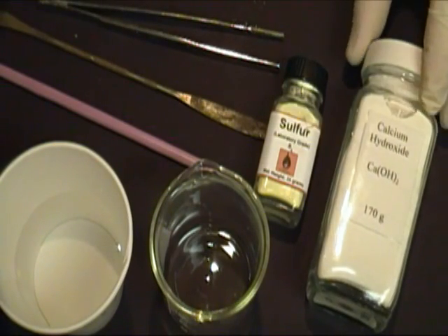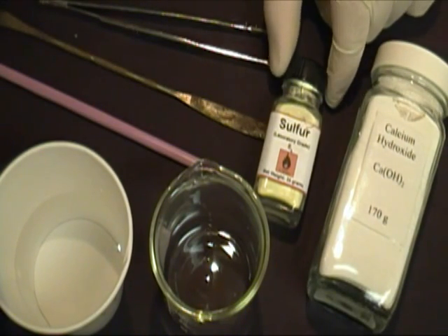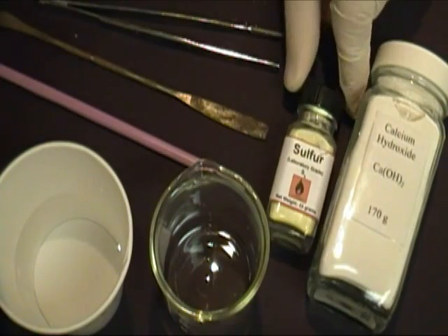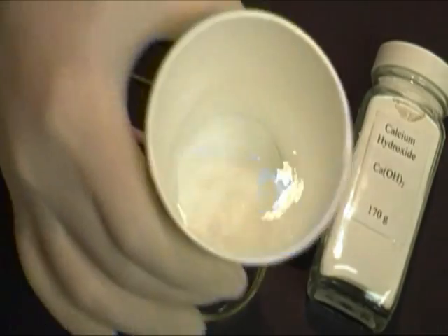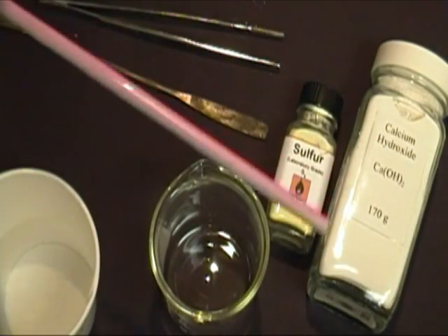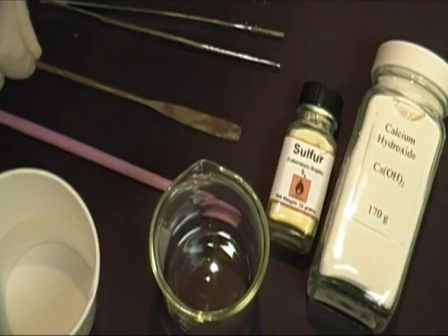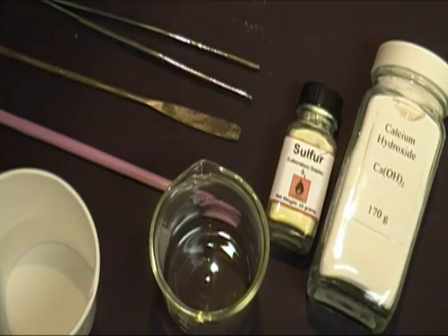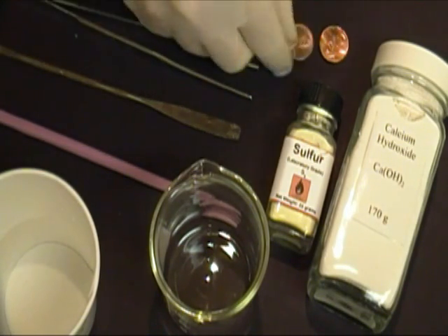To begin, you'll need some calcium hydroxide. You're also going to need some sulfur — this is lab grade, however the stuff you get at a fertilizer store should be fine. You'll also need a beaker to run your reaction in, some water, a glass stir rod, a spatula, and some tweezers. And of course, you're going to need some pennies — they'll need to be pennies made after 1982.